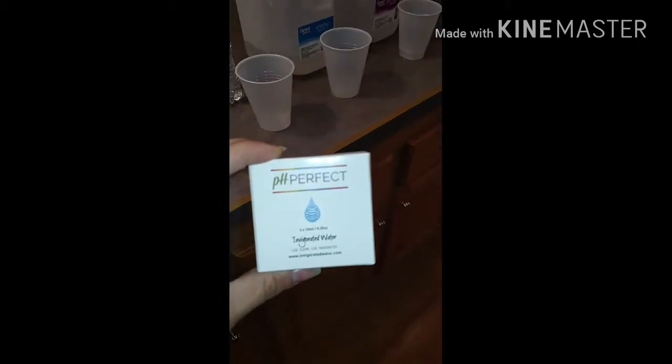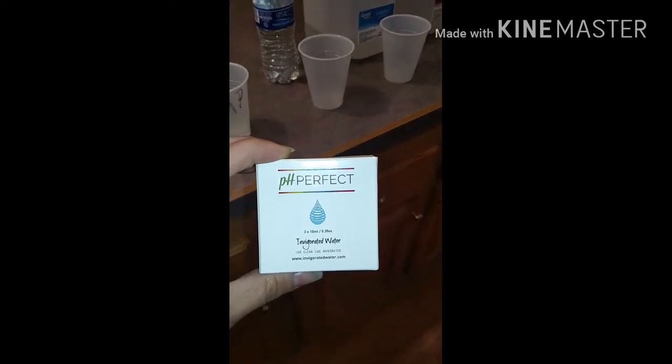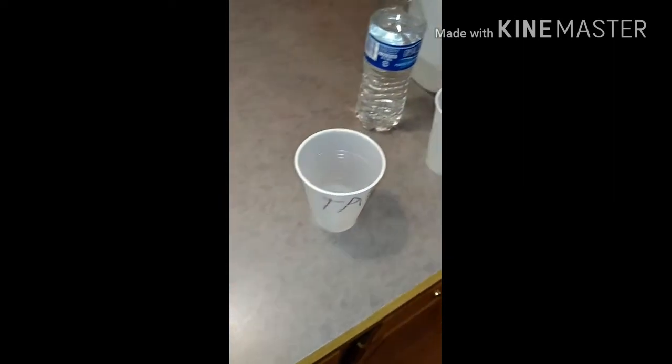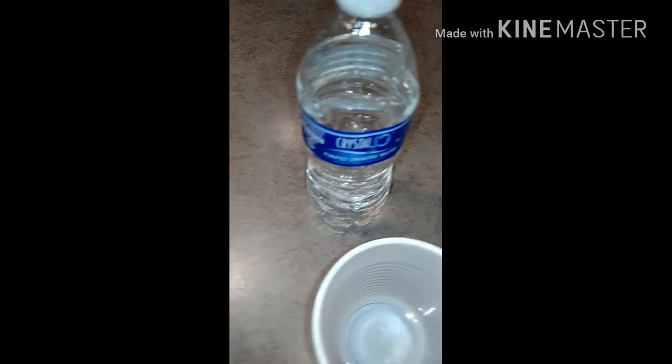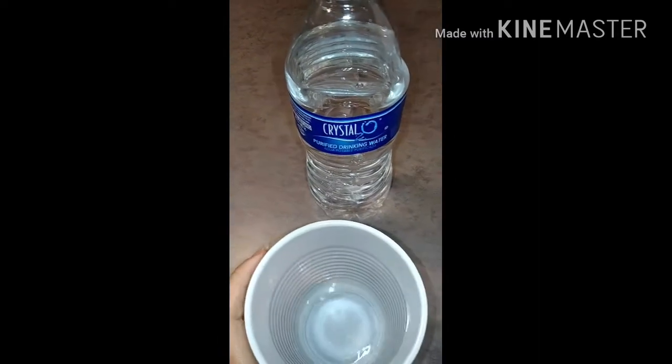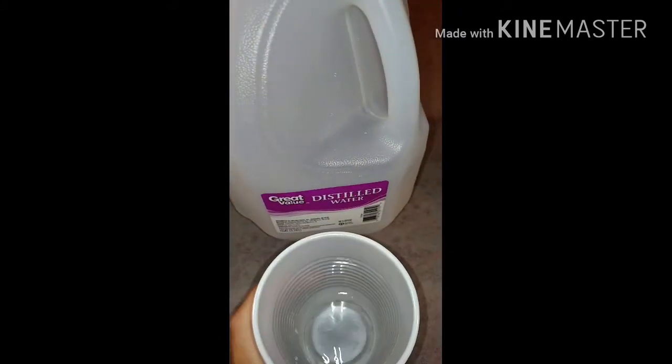Hopefully it'll be helpful to a lot of you. Here's the test kit — I ordered it off eBay, pH Perfect — and it says to put two to three drops for 1.7 ounces, so we already have the water pre-measured in each cup for each brand. This is the tap, and the Crystal 2O — so it's all already here.